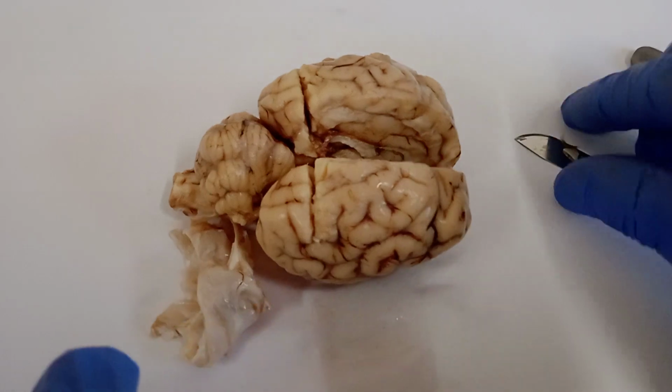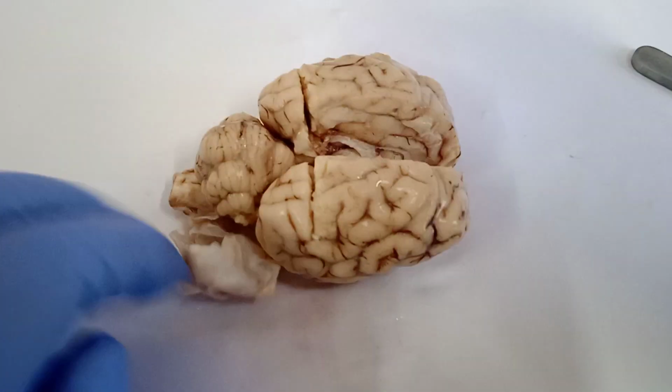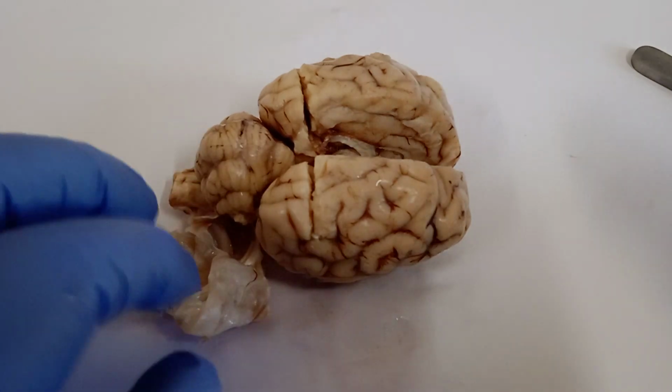So now we are going to give it a deep cut to separate it. So I am cutting this cerebellum. This is the cerebellum also. I am cutting this also.